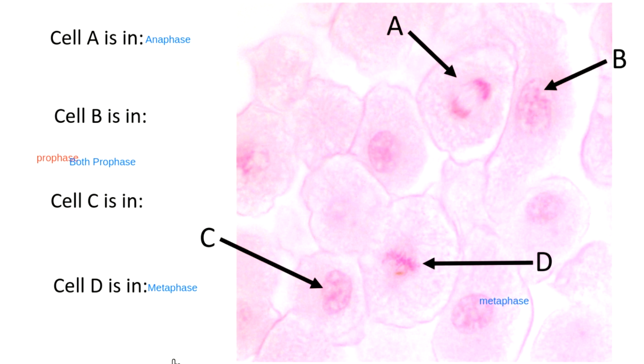Let me see. Bear with me here as I bounce. Let me see if I can find you a good example of telophase, because I know that we've got some good ones. Let's see. Let's just do some looking together. Actually, we'll look at good and bad together to practice this.